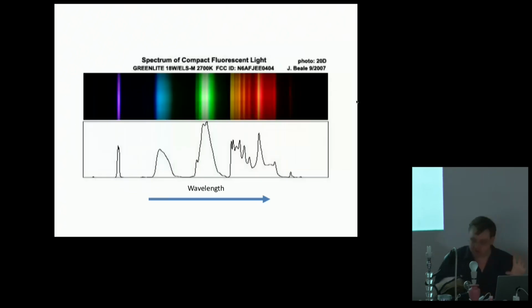So if you were to look at the detector, when you pointed it at something like a fluorescent lamp again, you would see something like the top image here. You would see lots of black areas where there's no light, and then you would see the actual light in its colors at different points. And the spectrometer basically just measures the brightness of that and converts that kind of image into this kind of graph with the relevant wavelengths on it.